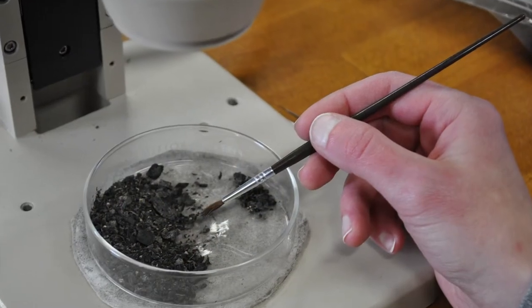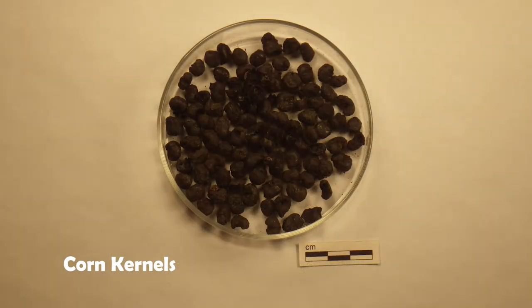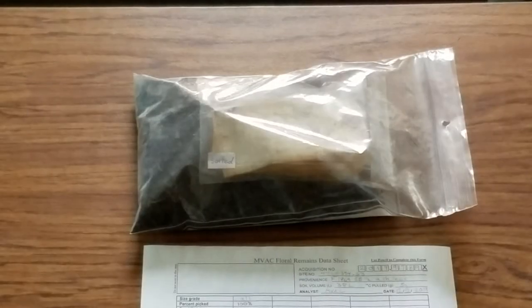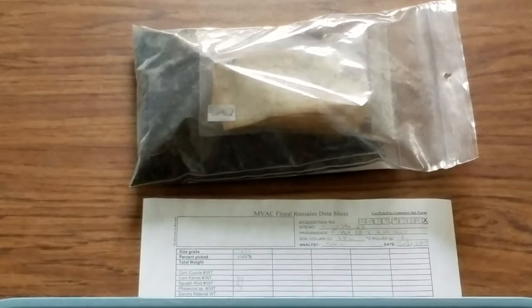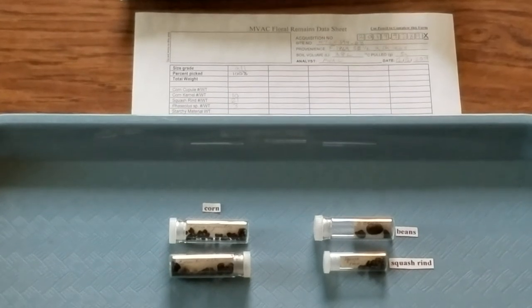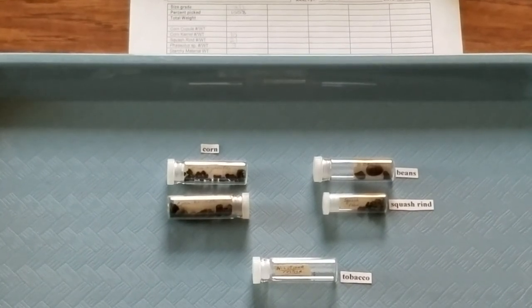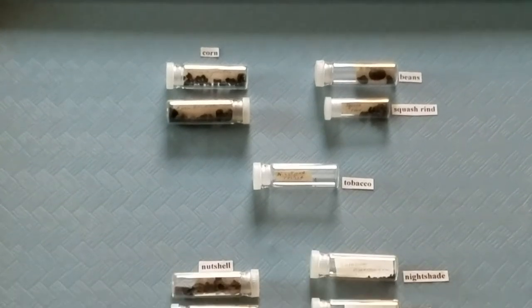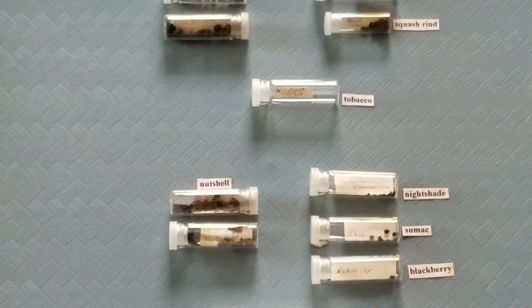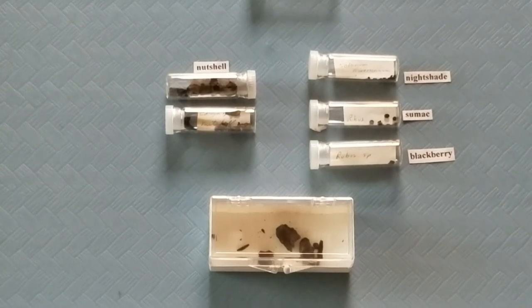We use a small paintbrush to separate different types of plant material. These can include charred remains such as blackberry, tobacco, and goosefoot, corn kernels and cob fragments, nutshell, and wood charcoal, as well as modern plant remains such as uncharred seeds and rootlets. Once analyzed, plant remains tell us about the local environment and how people used plants for food or other purposes. Charred corn, beans, squash, and tobacco seed provide evidence that these crops were grown and eaten — or in the case of tobacco, smoked. Nutshell and seeds from fruits such as blackberry show that people were collecting wild resources from nearby wooded hillsides. Charred plant remains can also be used for radiocarbon dating that tells us when the site was occupied.